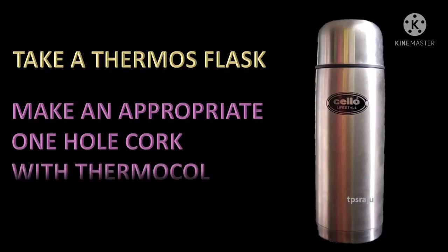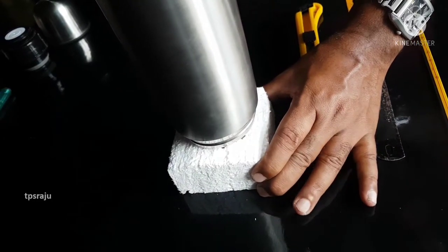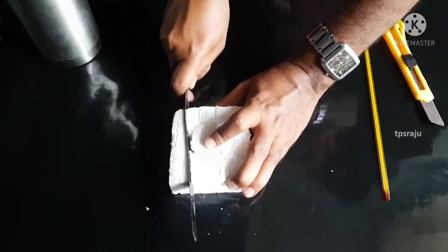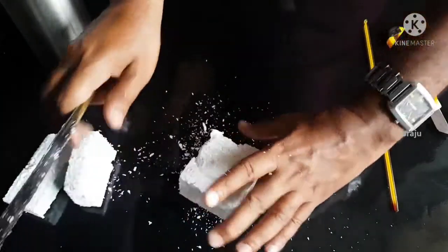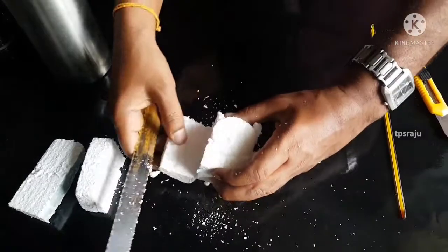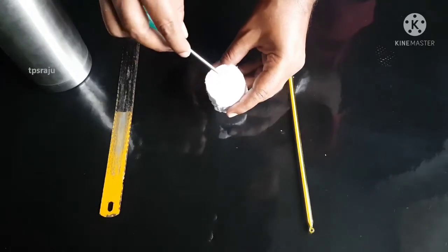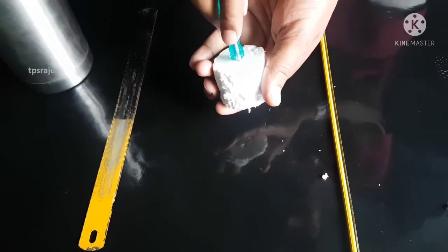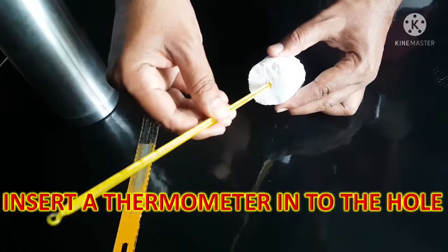Take a thermos flask and make an appropriate hole in the cork with thermocol. Then insert a thermometer into the hole.